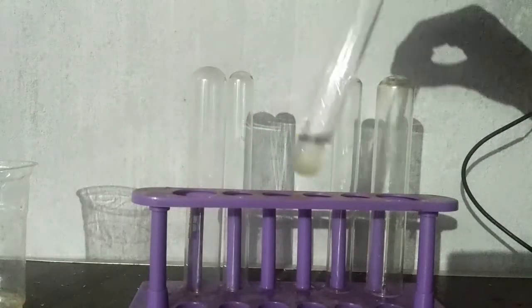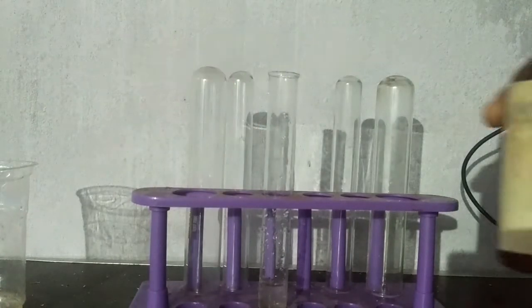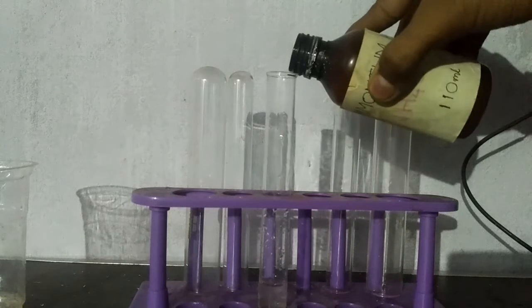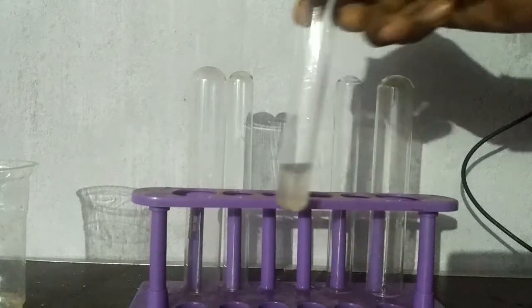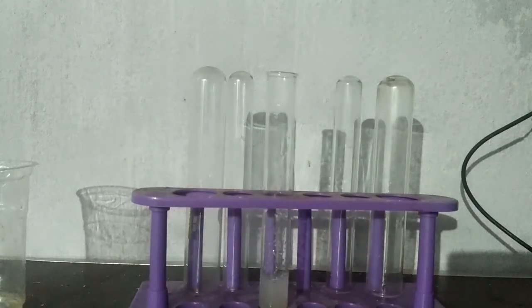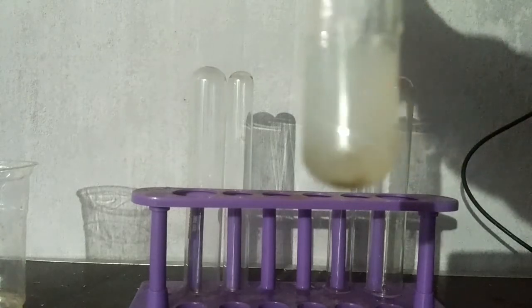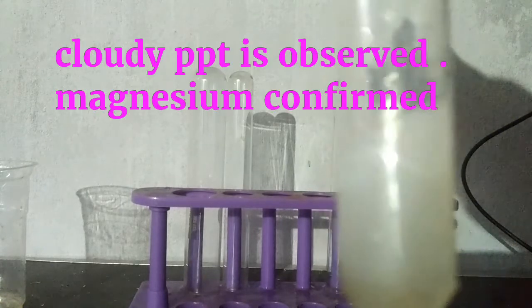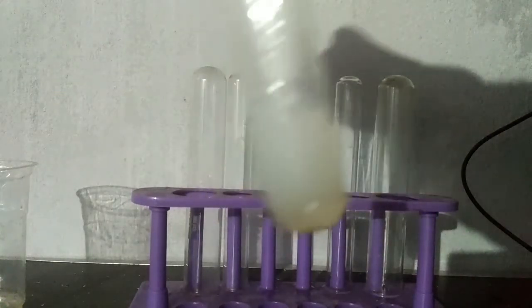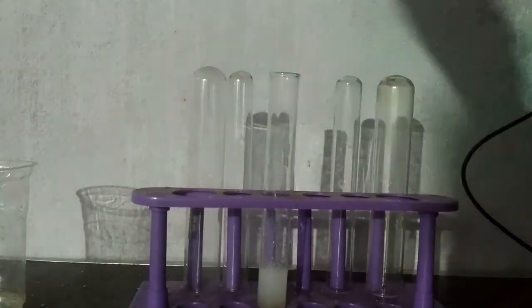Take the contents of group 5 and add ammonium hydroxide solution, then add di-sodium hydrogen phosphate solution. You will get a thick white cloudy precipitate — magnesium confirmed.